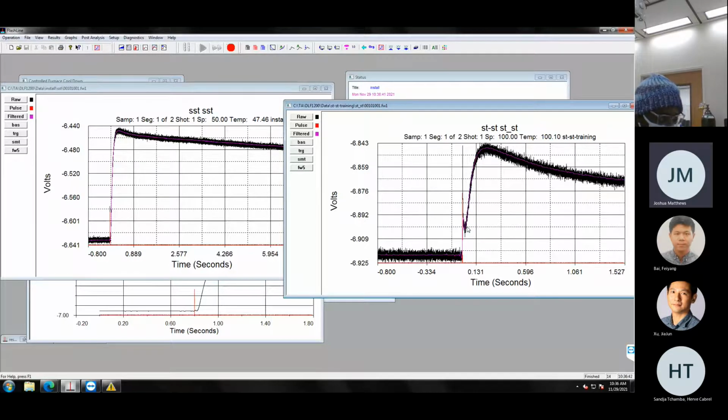So no light can go through your sample for them to work in this instrument. The graphite spray can get you some of the way there, but if you're using some sort of glass, you might have to sputter coat it with a highly conductive material like gold or silver, and then coat it with graphite spray to fix that problem.